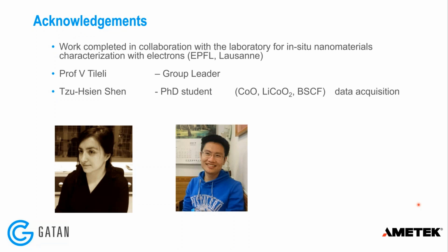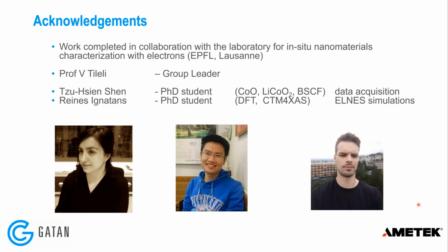Sue Shen acquired the spectrum image data from cobalt oxide, lithium cobalt oxide, and the BSCF sample. And then Renis, another PhD student in the group, has done a bunch of fine structure calculations using density functional theory and charge transfer multiplet code.